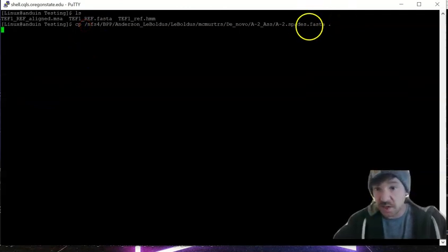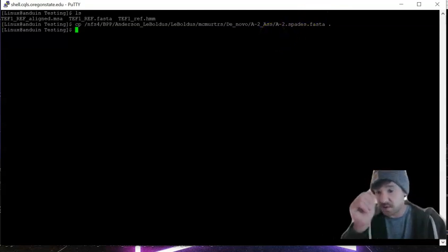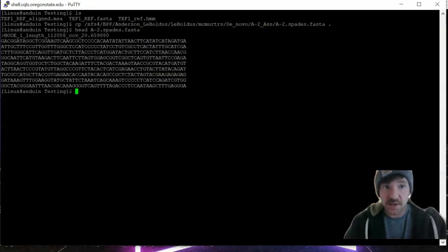So this is a full genome sequence for a Coniferporia sulfuracans sample. And if we do head on that, we can see the contents. It's just different nucleotides, A, C, T's, and G's. There should be around about 39 million of these.